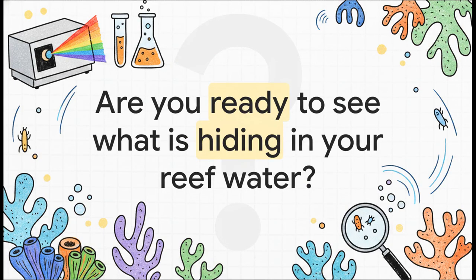By stepping beyond those big 3 macro elements and utilizing the power of a laboratory spectrometer, you give your ecosystem exactly what it needs to thrive, while catching those silent killers before they ever strike. This explainer has really shown us that ensuring long-term stability and vibrant coral coloration requires looking much, much closer than we ever have before. Which leaves us with one final and honestly very important question to consider about your own aquarium. Are you ready to see what is really hiding in your reef water?